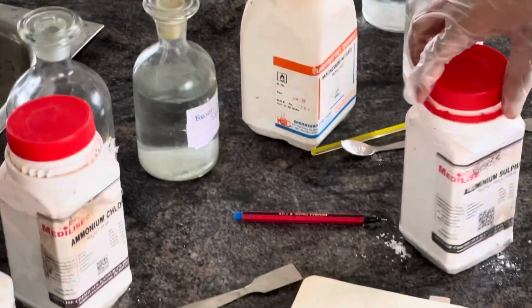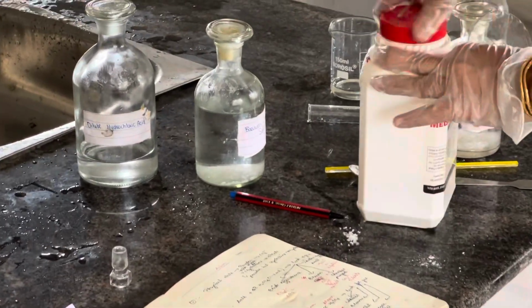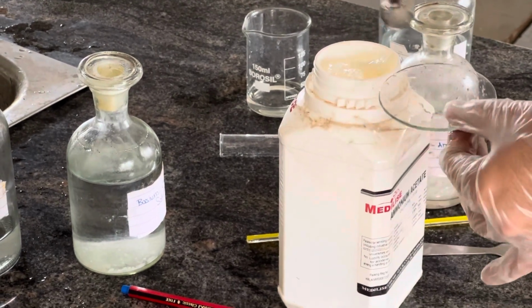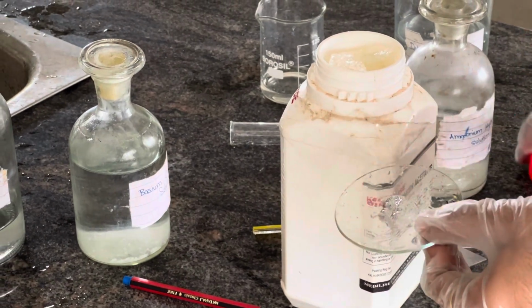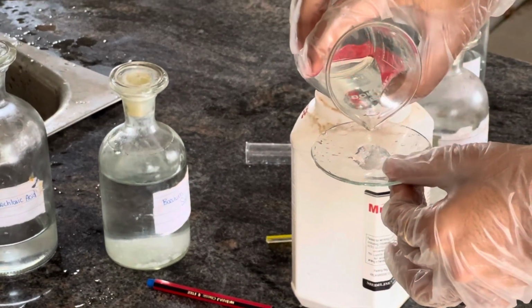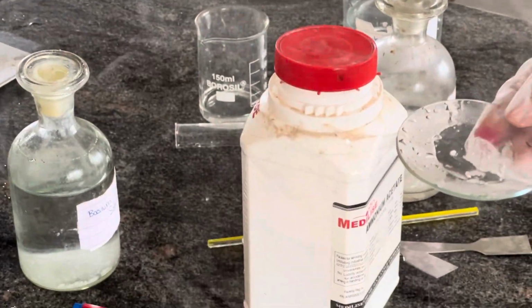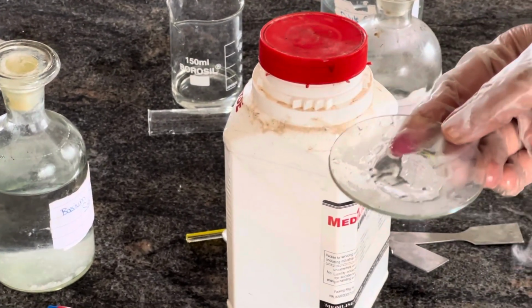Next, in order to test for the presence of acetate, take a pinch of salt in a watch glass and then add concentrated sulfuric acid to it. As soon as you add concentrated sulfuric acid, if you get a vinegar-like smell, then it infers the presence of acetate. So here the salt may be containing acetate.